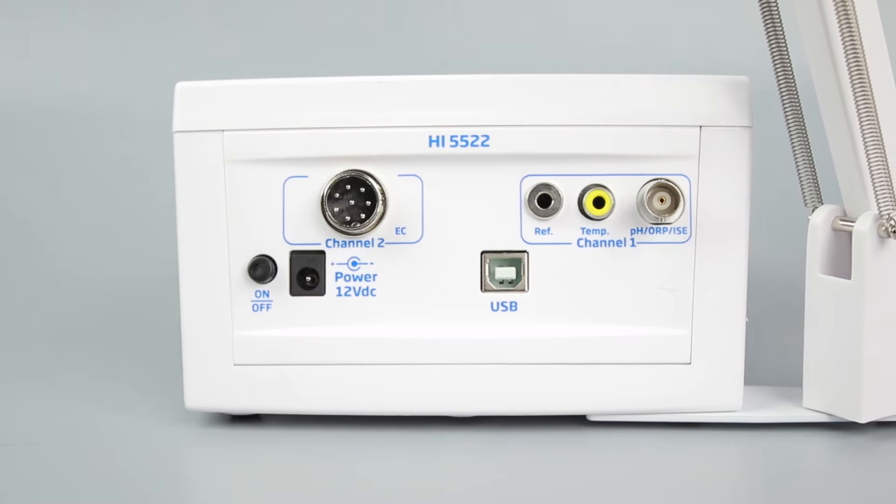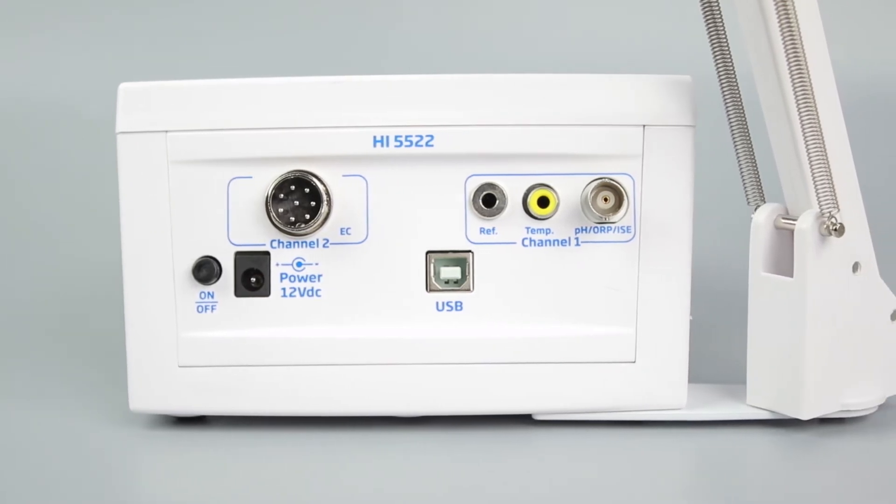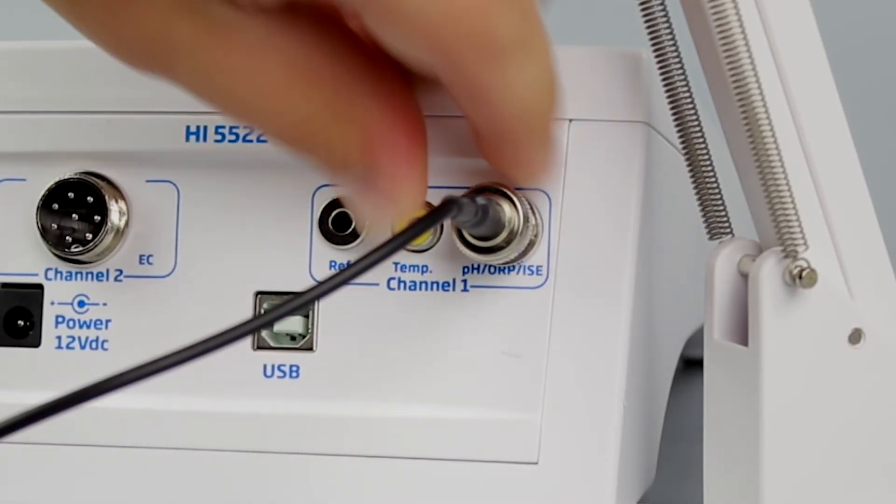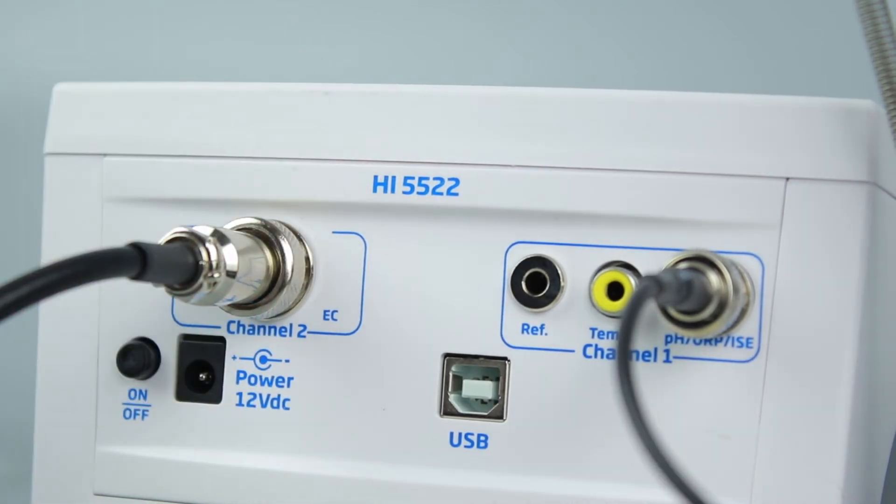On the back of the meter, you will see inputs for each channel. Attach the desired sensors to the inputs and make sure that each connection is securely fastened.